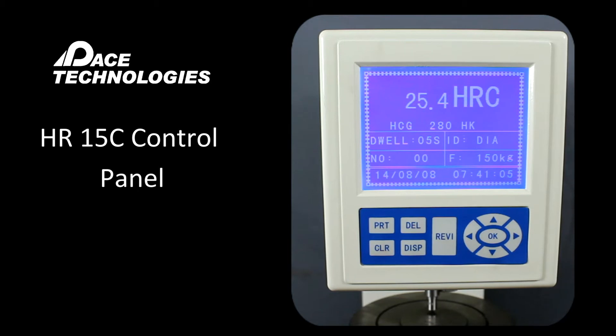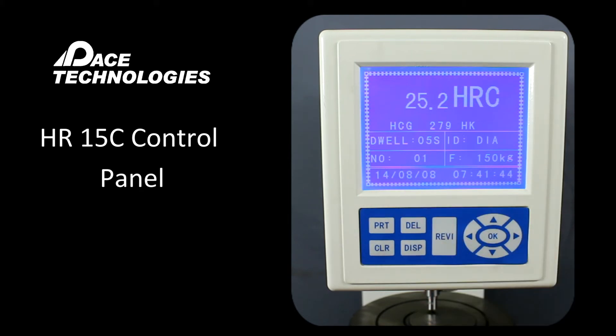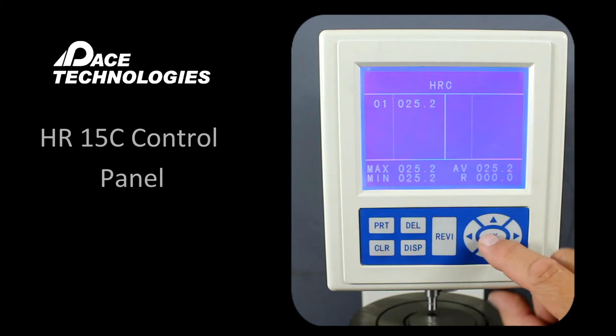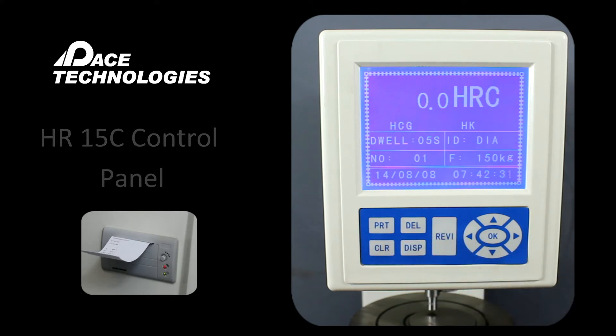Let's go ahead and back off the screw, go to another location, and make another indent. Again we'll take this up to a value of approximately 580. Now you can see we have a value for the first test right here. Let's go ahead and back off the load. If we press Display now, it's going to show the results of the first measurement we've made. As we continue to add more measurements, it will give us a minimum, a maximum, and an average. When we're ready to print our results, we can press the PRT button and the results are printed.